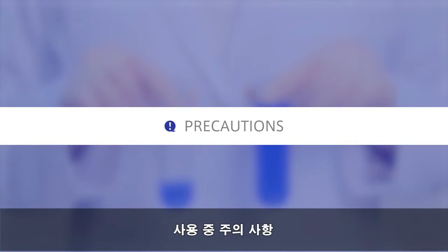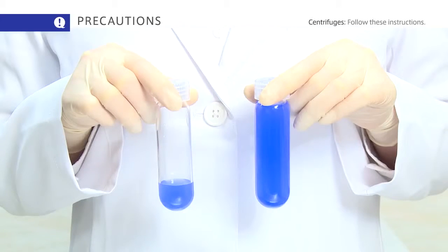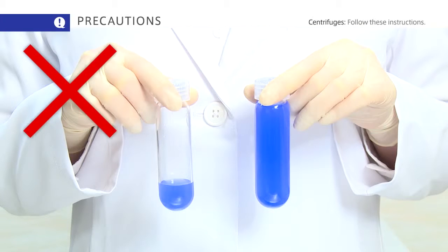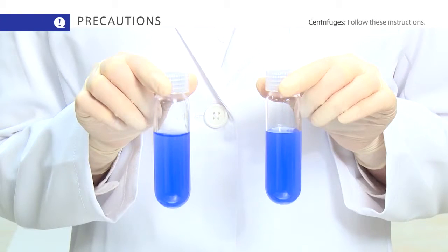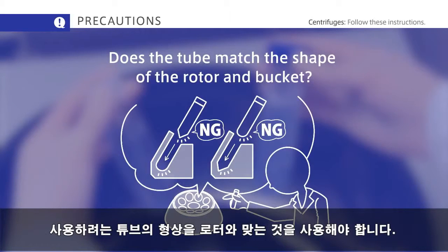Next, here are some precautions to observe during use. Make sure the tube sample volume is correct. Make sure the tube matches the shape of the rotor and bucket you are using.